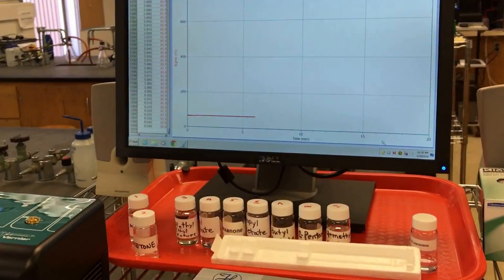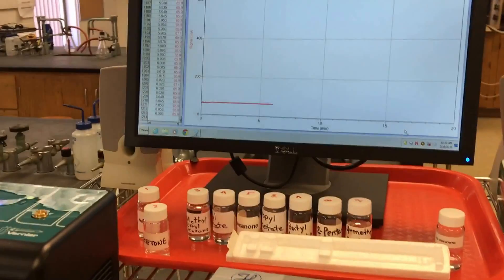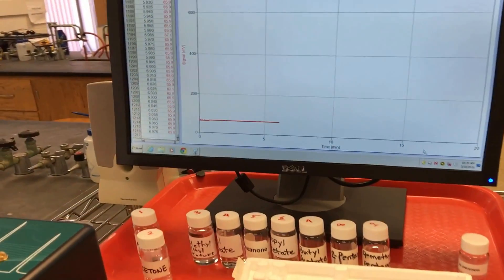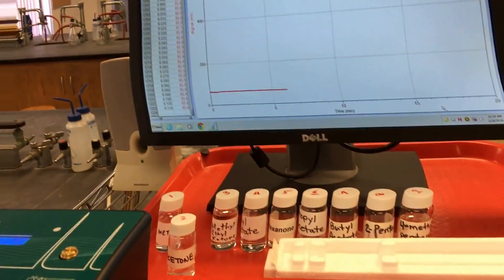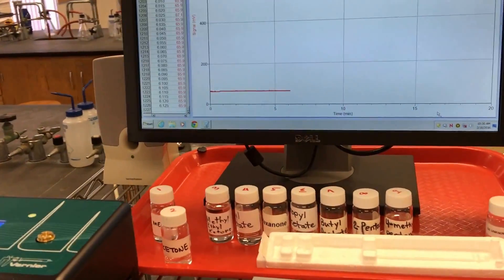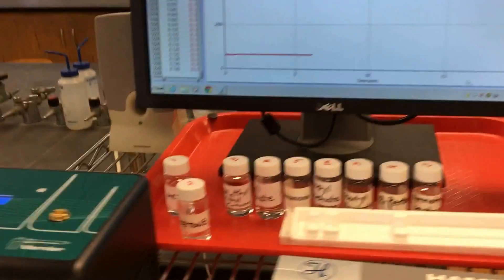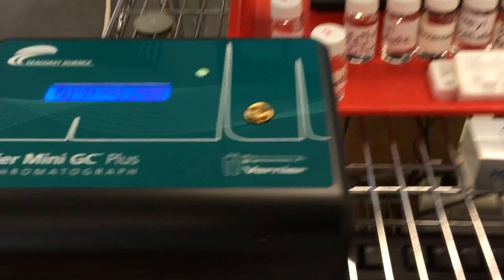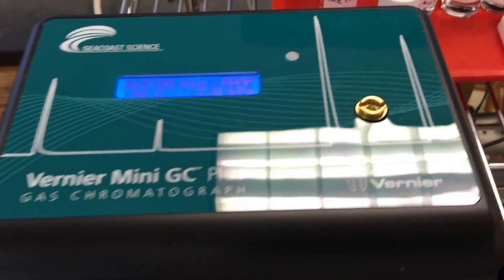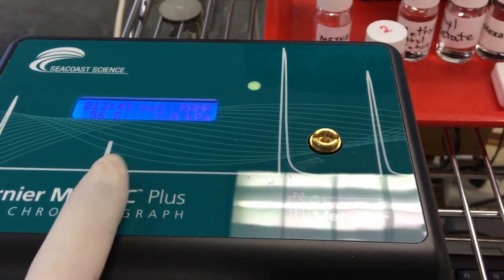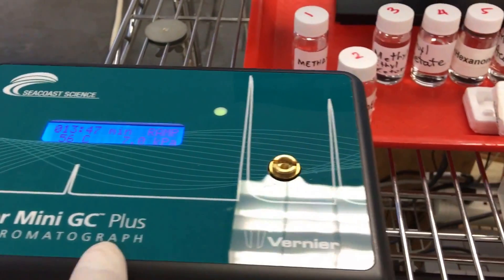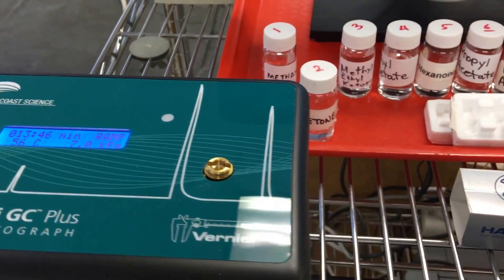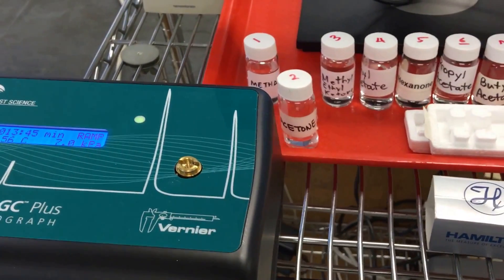Hi, I'm back. It's Thierry again. Today we continue on the GC Vernier GC Plus Gas Chromatography for our chemistry lab.